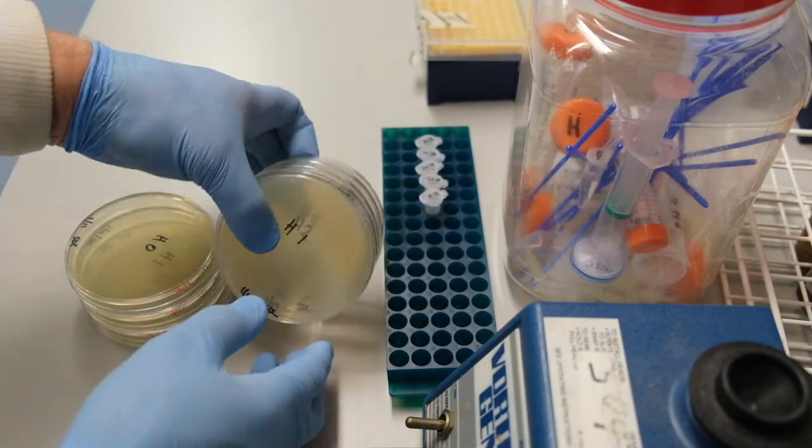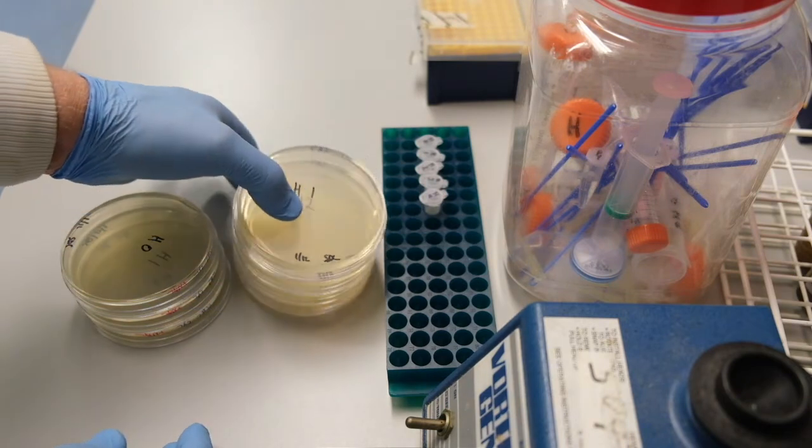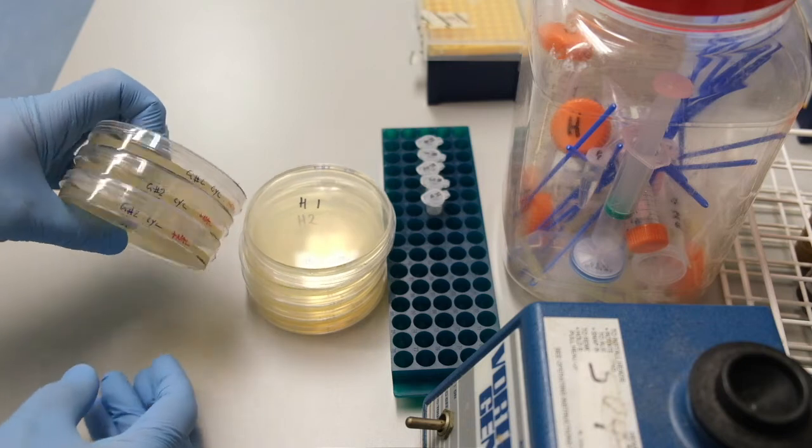For soil sample H, I only have three plates left with nalidixic acid, so I leave out the 10 to the minus 3 dilution.